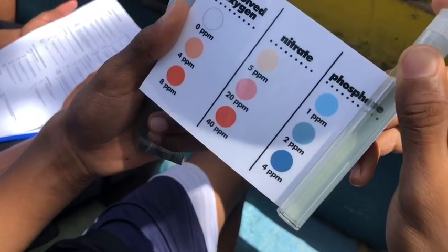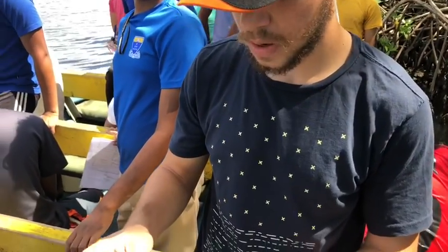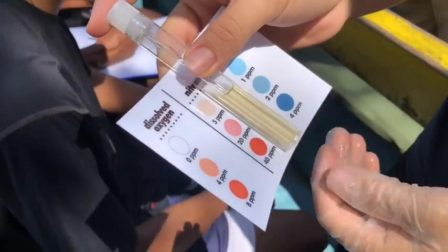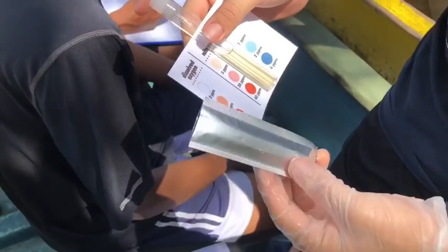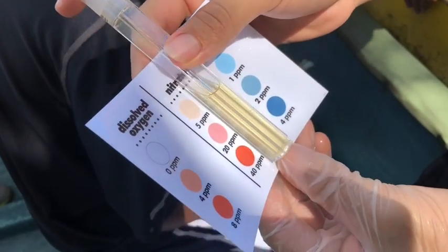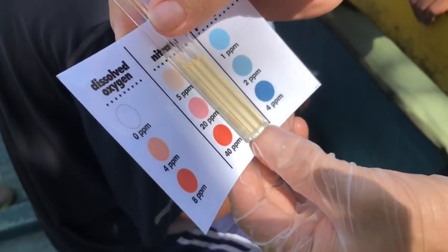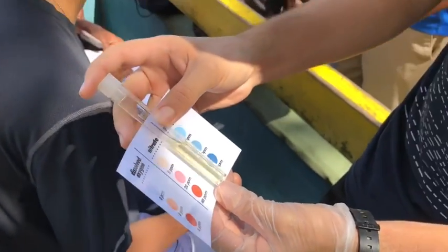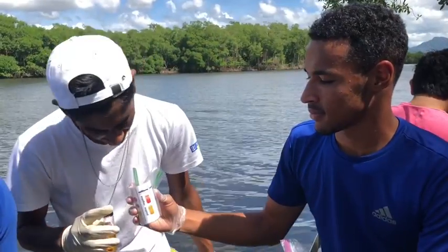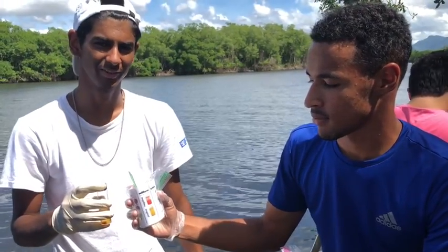So I just completed the nitrate test. After placing the tablet in the water and letting it dissolve, then letting it sit inside the sleeve for five minutes, we get this reddish color. When you compare it to the scale, you can see it probably has around 10 parts per million of nitrate in the water. Well done. So this is Team B and Team B is testing fecal coliform.